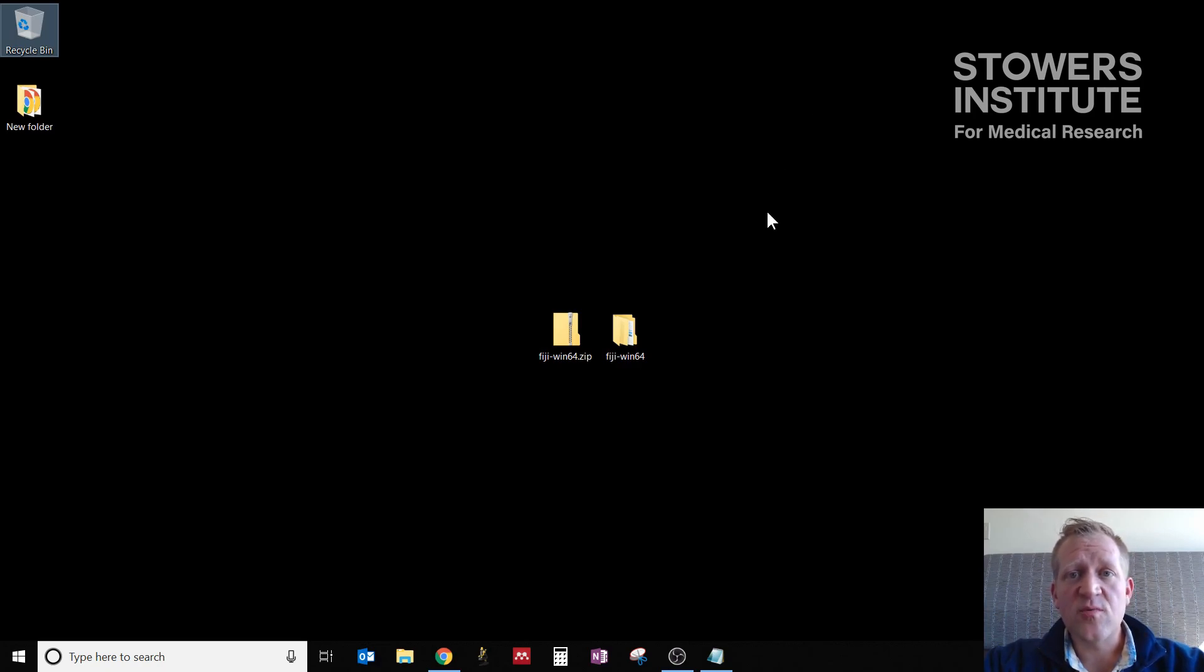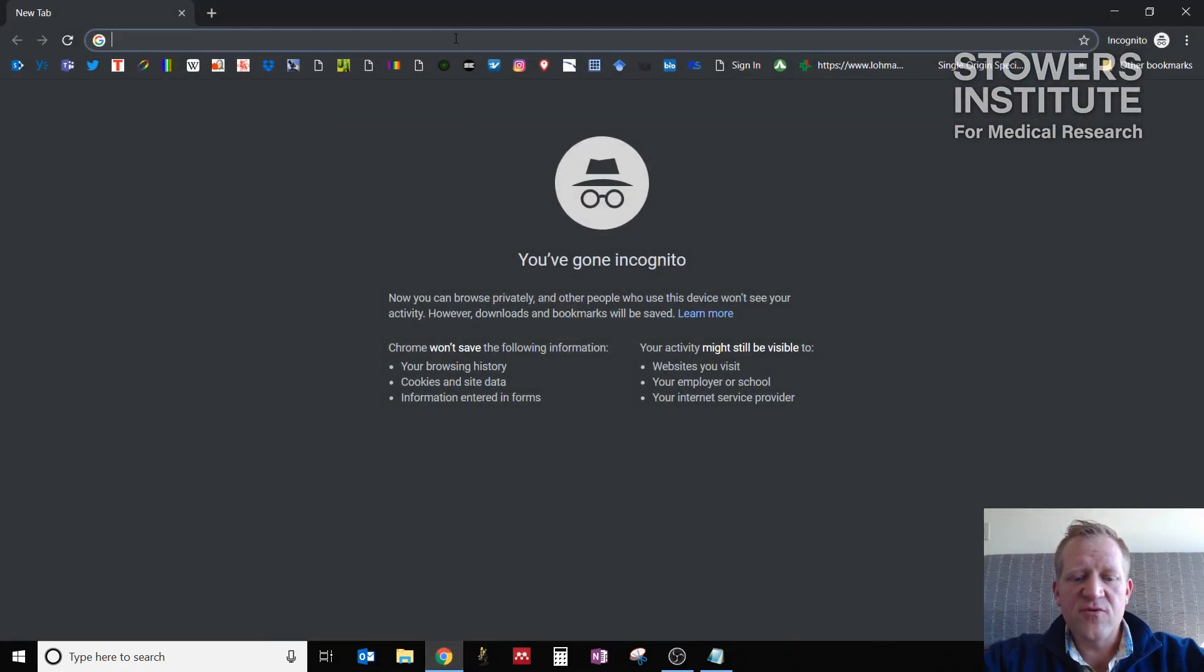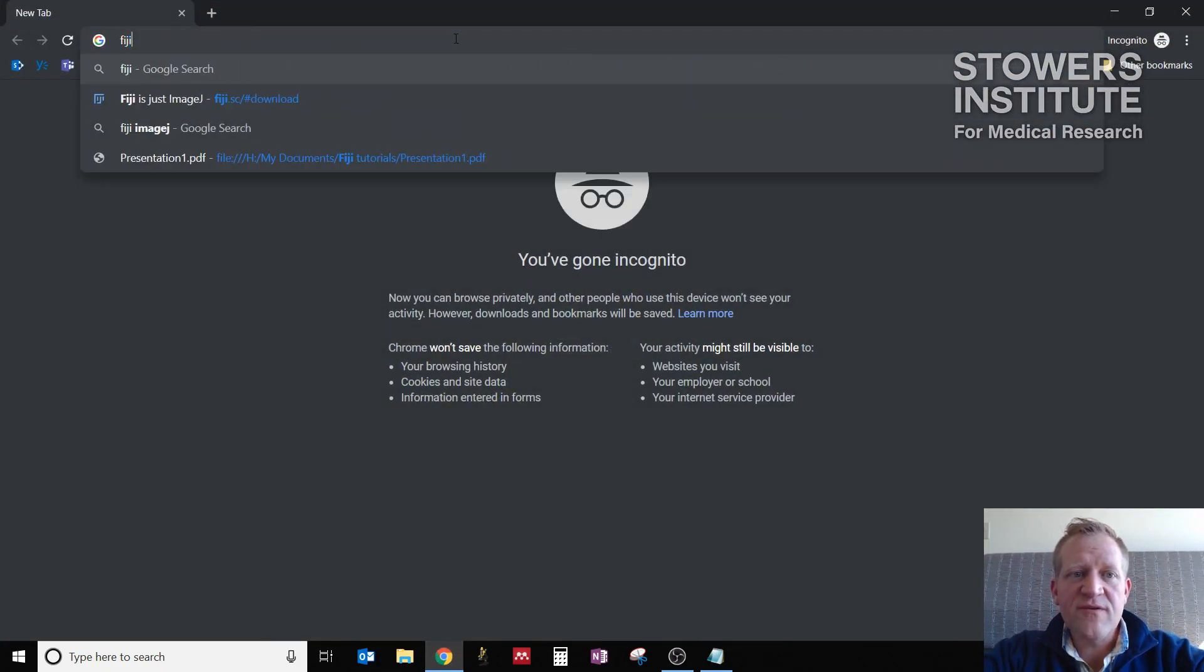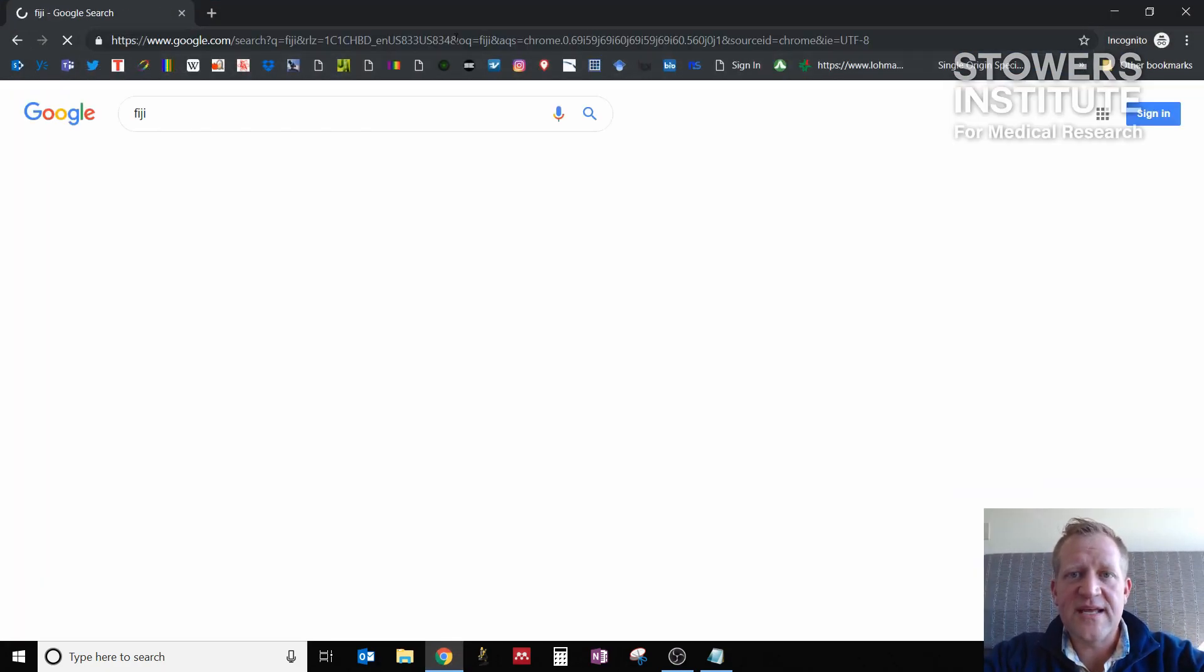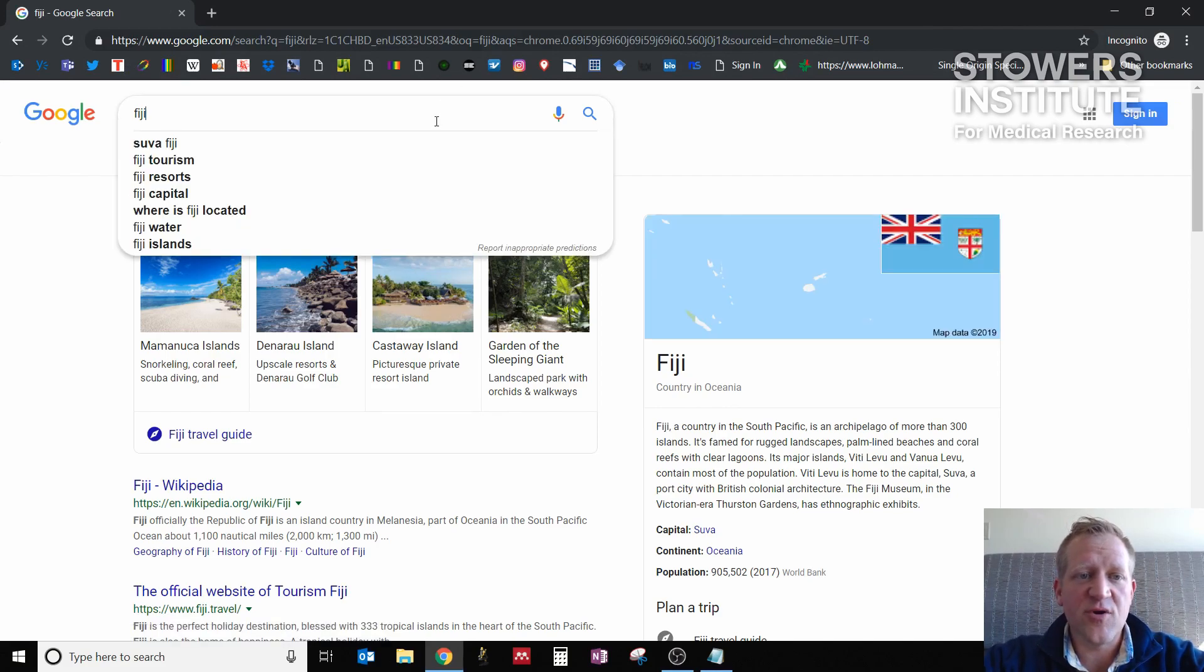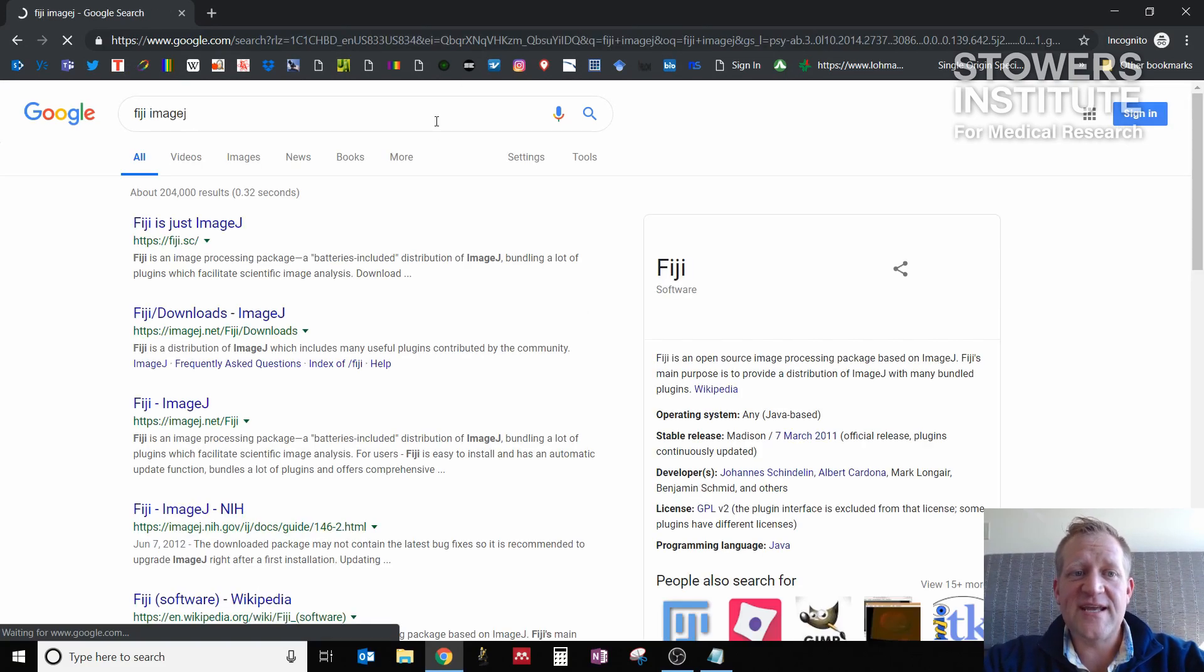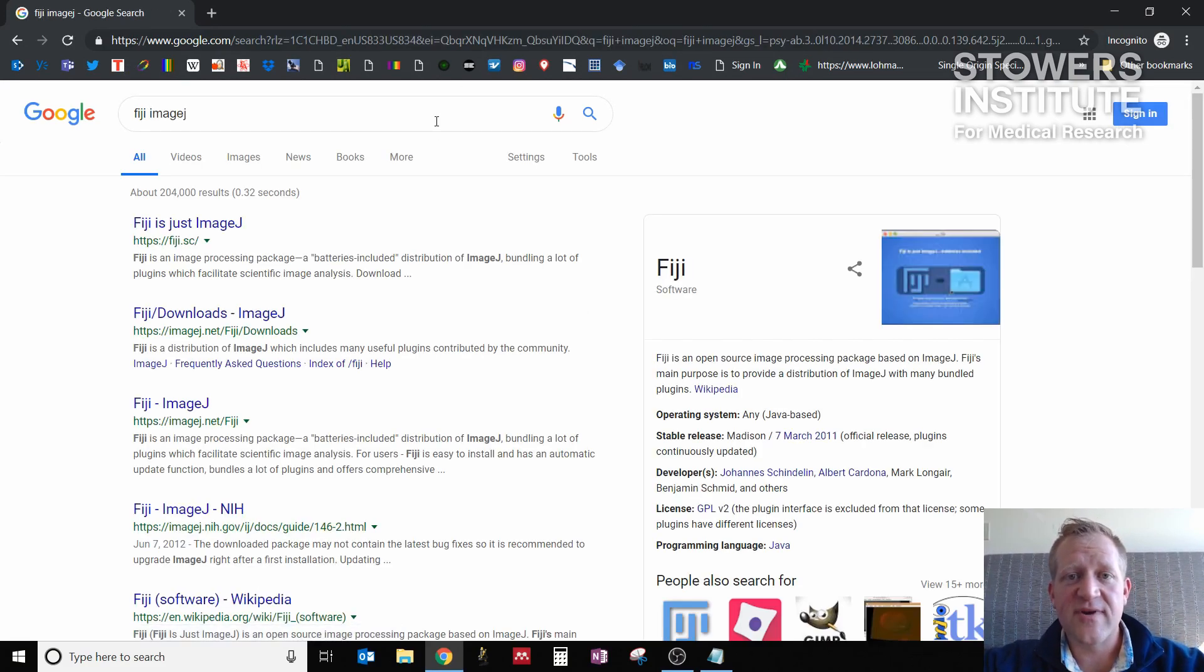To do that, you're going to want to Google search for Fiji. That's pretty straightforward, but if you Google search only for Fiji, you'll get hits for the country rather than the processing program. So if you add ImageJ at the end, you'll get to the right link.